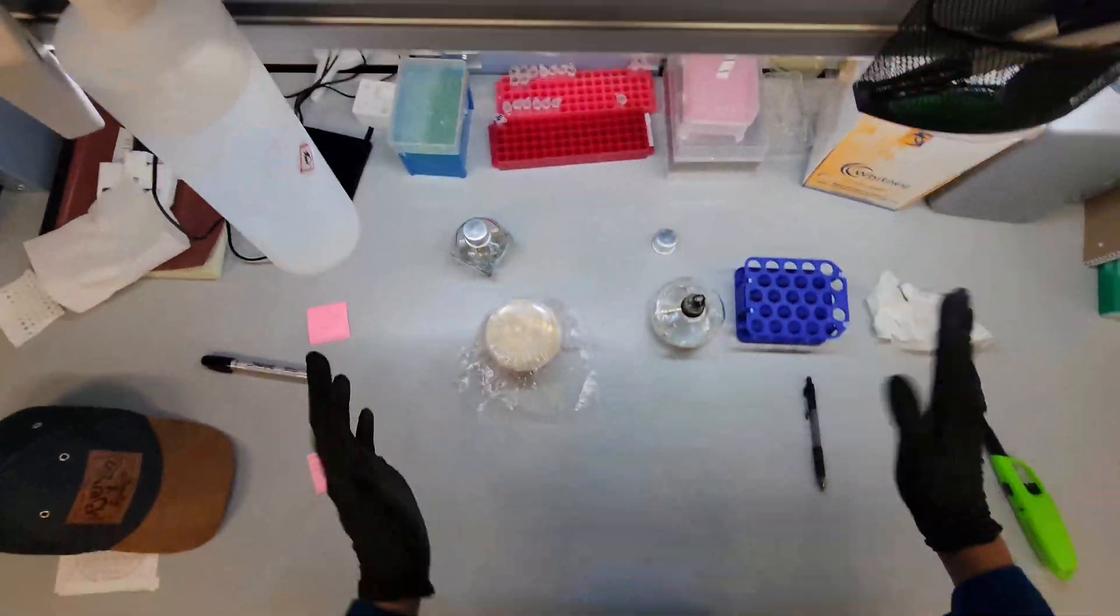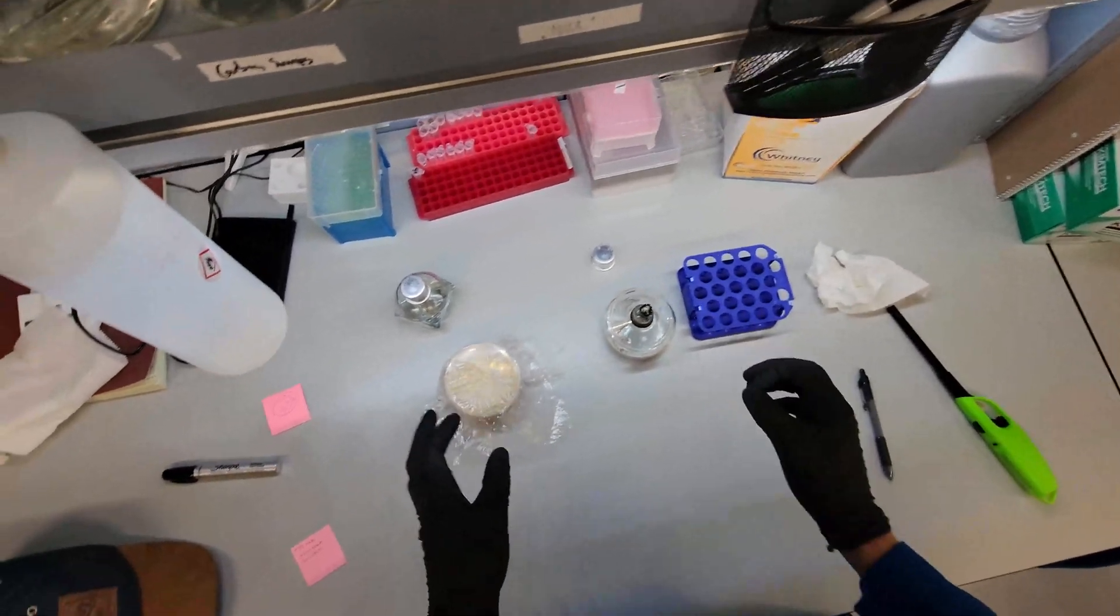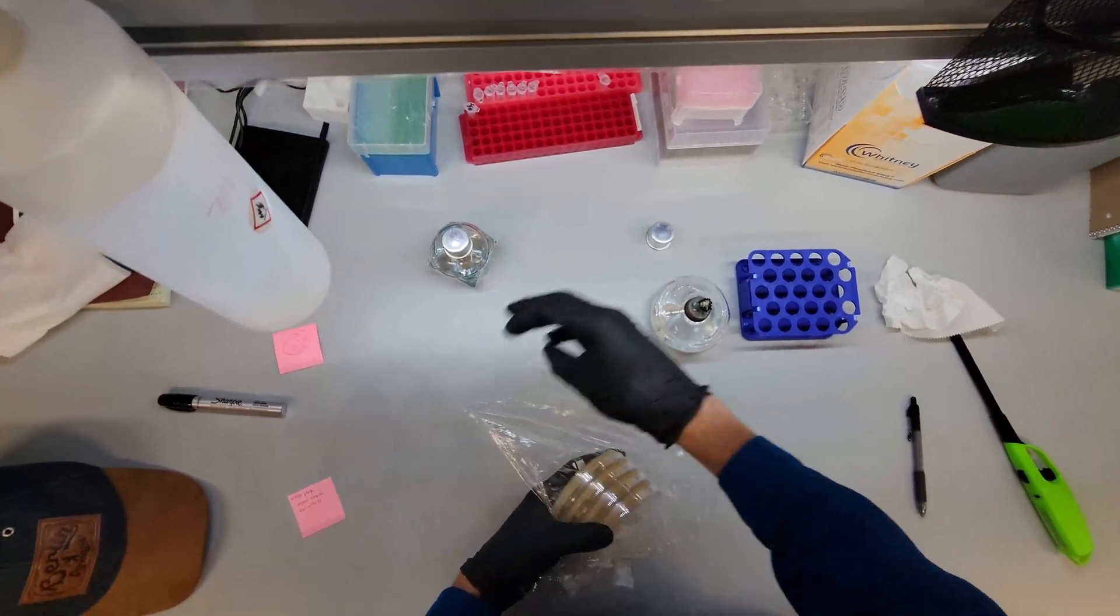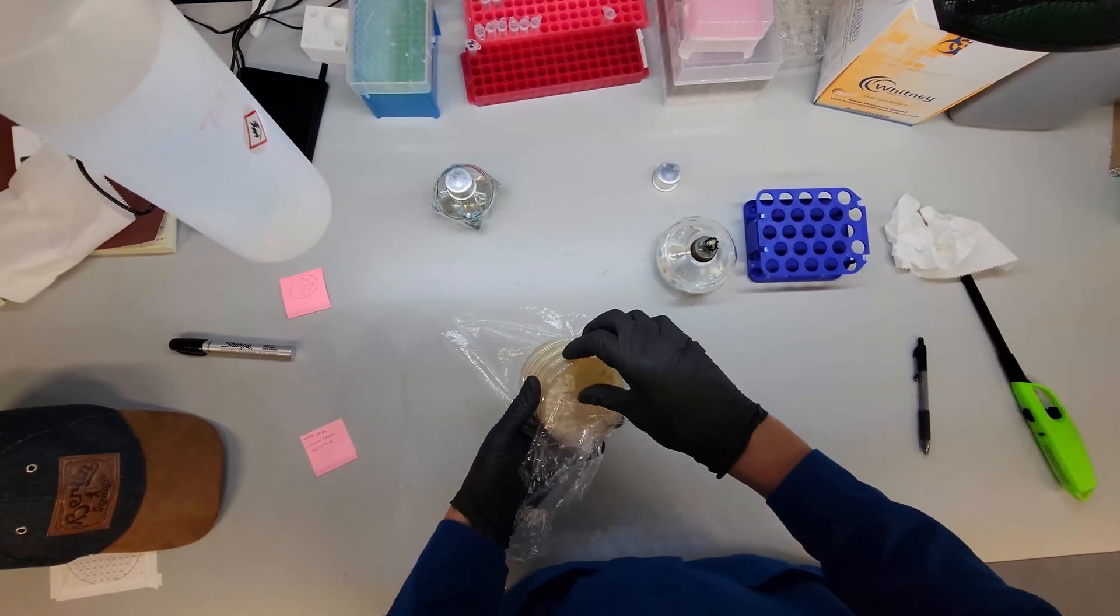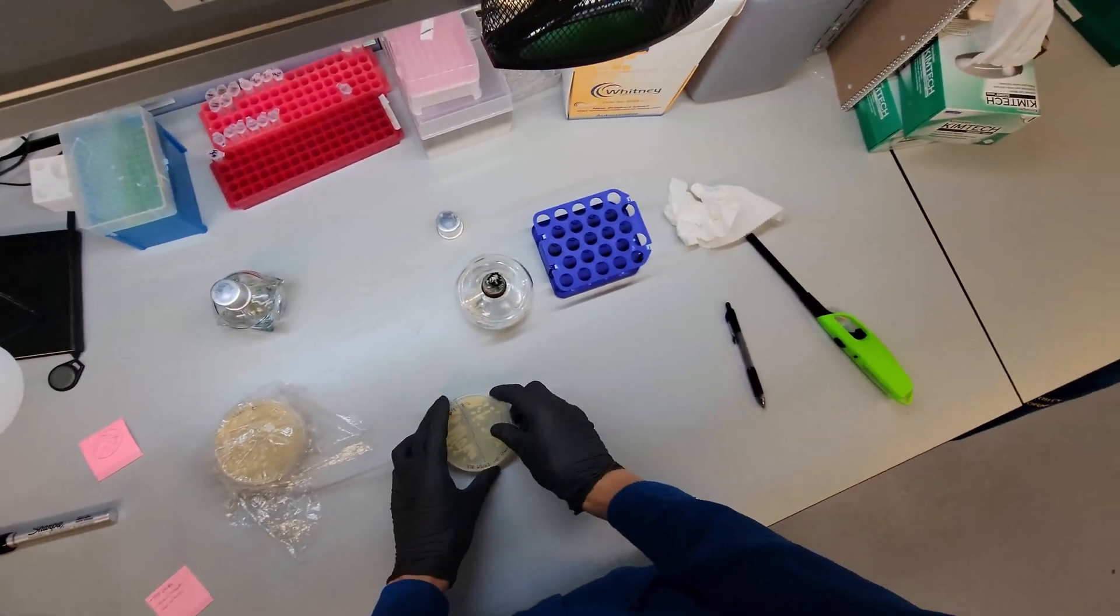So everything here we want to be sterile, really, really sterile. We don't want any contamination in our overnight cultures. So I'll just start two different cultures just to demonstrate. This is G12 and Z12, these strains here.